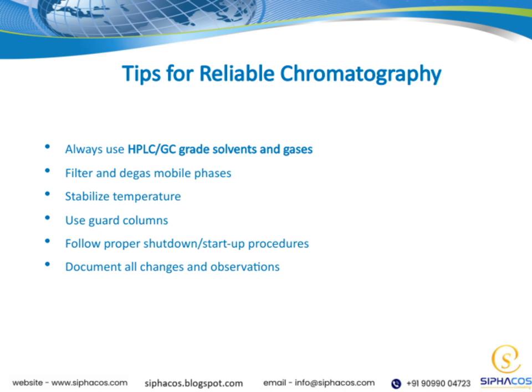Stabilizing the temperature is another key factor. Maintaining a consistent temperature helps improve reproducibility and peak resolution. Using guard columns is also highly recommended. They act as a protective barrier for your main analytical column, extending its lifespan and maintaining performance. Following proper shutdown and startup procedures is essential too. This ensures your equipment remains in good condition and reduces the risk of introducing variability or damage.